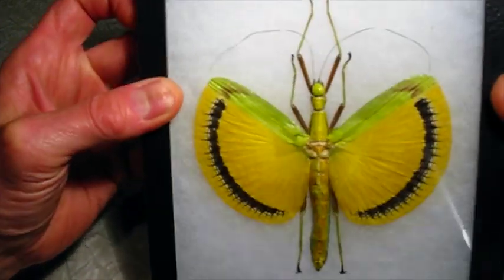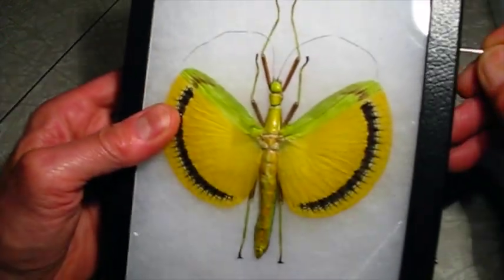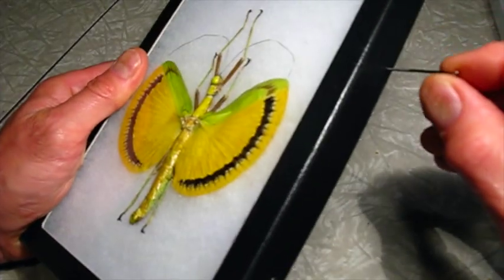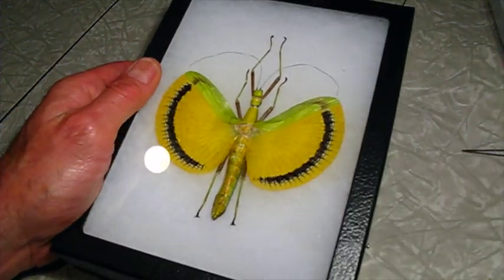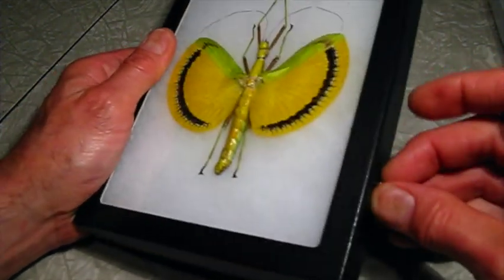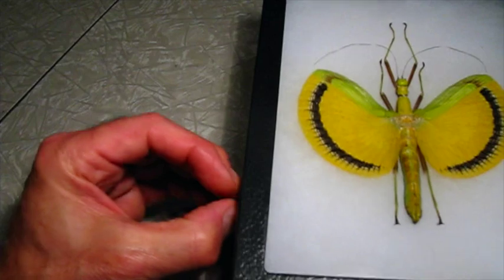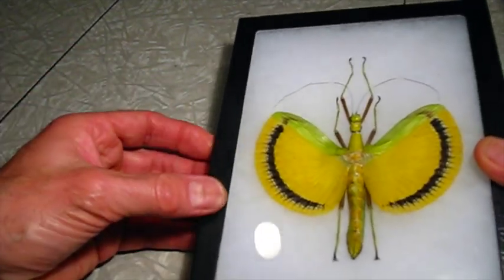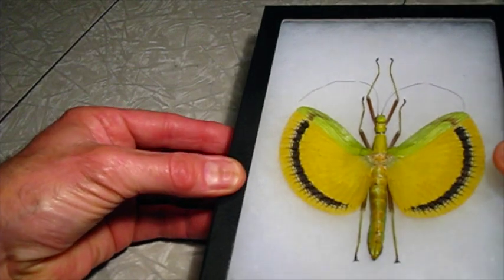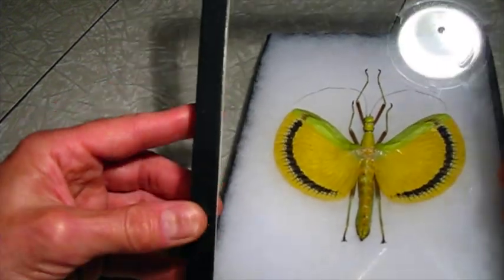Today I'm going to go through the steps on how to do that. I'm going to start with the stick insect since it's less fragile. These Riker mounts are held together with a big stainless steel pin — kind of like a nail. You can pull those out and then the lid comes off. These are dried, as all insect specimens are, so they're a bit fragile and you want to be gentle with them.